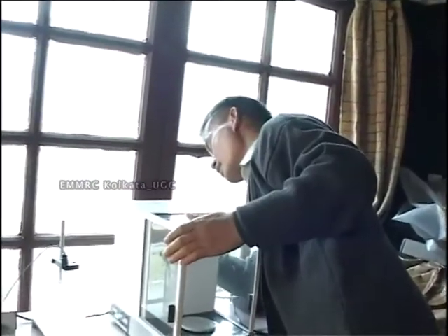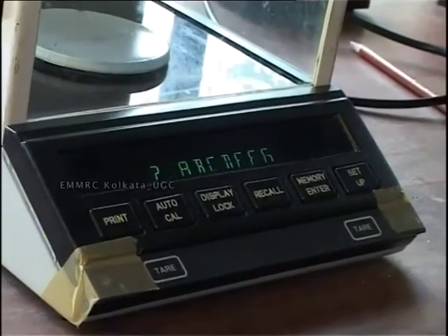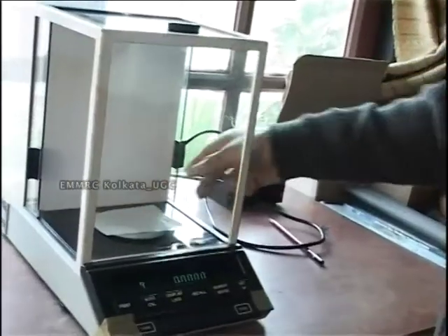This weighing machine is capable of weighing very small quantities. When you're using growth hormones for your culture media, you require very minute quantities. You don't use grams; we use milligrams: 1 milligram, 2 milligrams, sometimes even 0.5 milligram. For that reason, you need an accurate balance which can take very minute quantities. Otherwise, you cannot take even 1 gram, because that may be the lowest unit. That is why this is very useful. You just put the paper first.